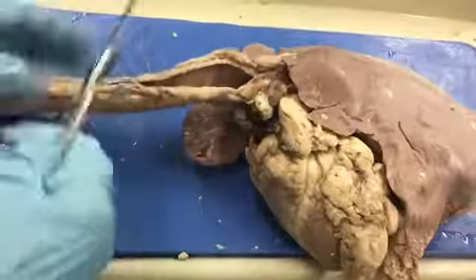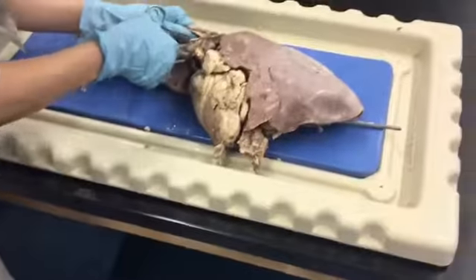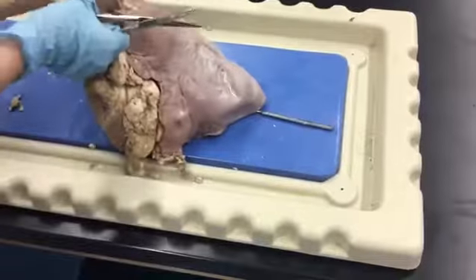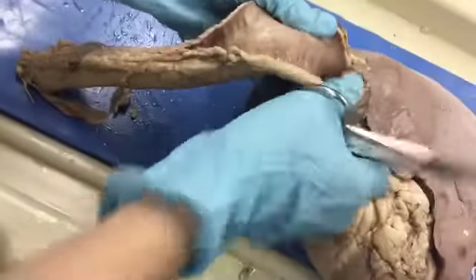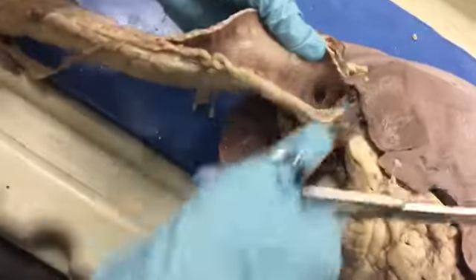Some are done, I have to cut more. Oh, there you go. There we go. Now get in there. See, right there's a hole, and right there's a hole. You got it all done? The bronchi. Okay.